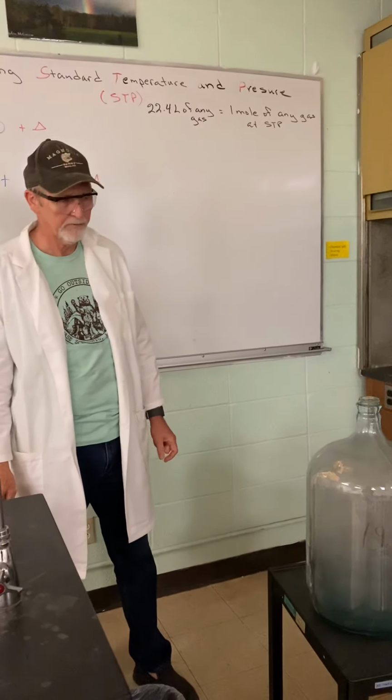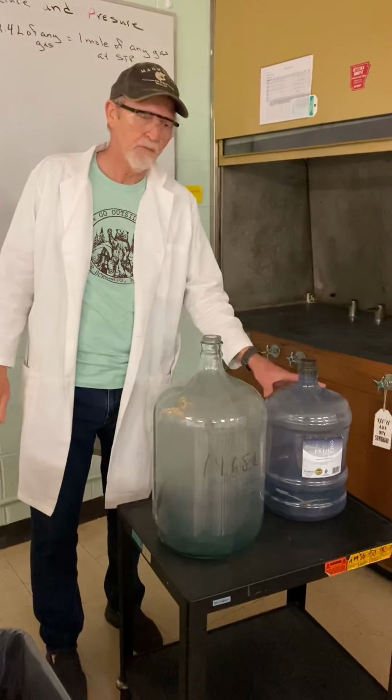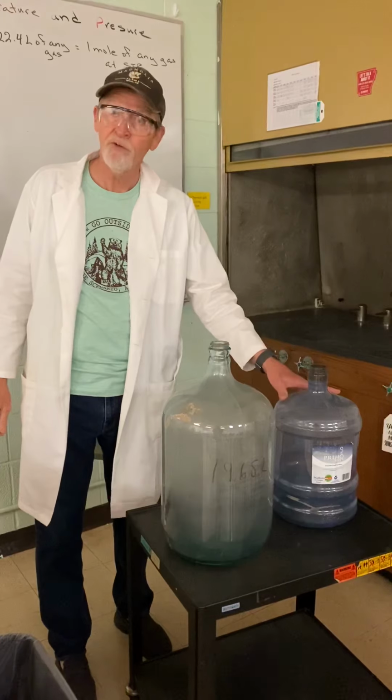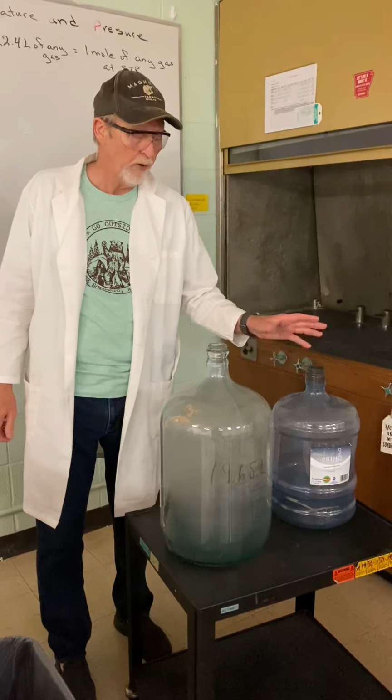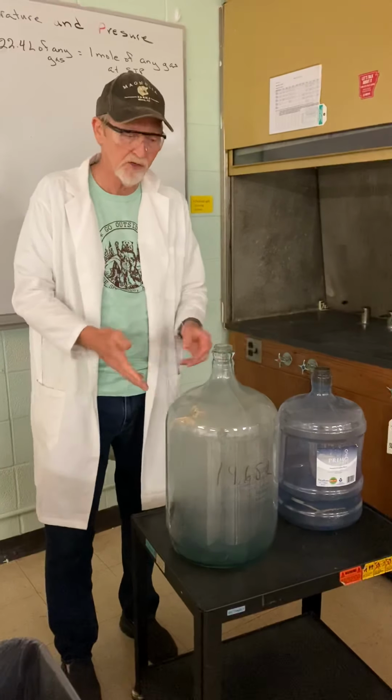That was interesting. Based on that, you would think that there's more fuel in that. So we have to assume that I added some more oxygen to it. If that works, let's try this one.